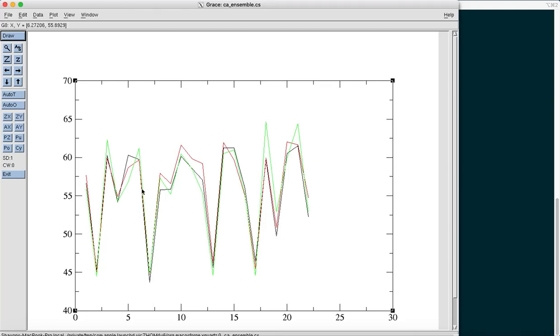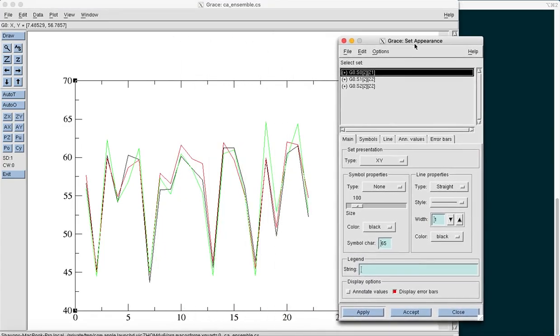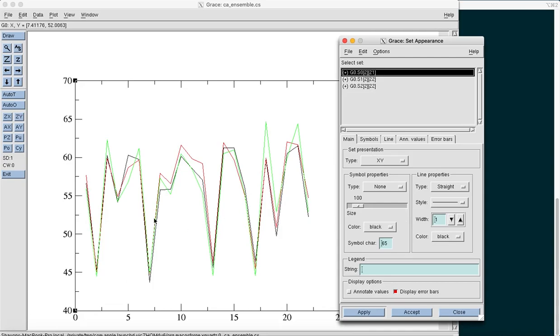And the first line is the experimental chemical shift value here, which is in black. So this one in black is basically the experimental chemical shift, and you find that for residues 35 to 56, which is now changed to 1 to 22 out here, you can clearly see that for the beta hairpin, the predicted chemical shift values match up very well with that of the experimental chemical shift values.